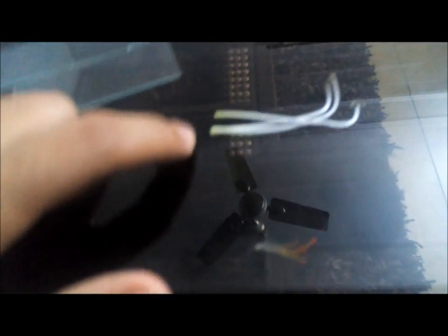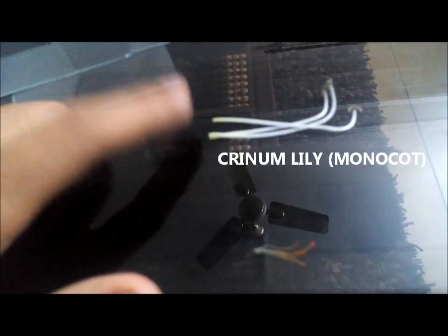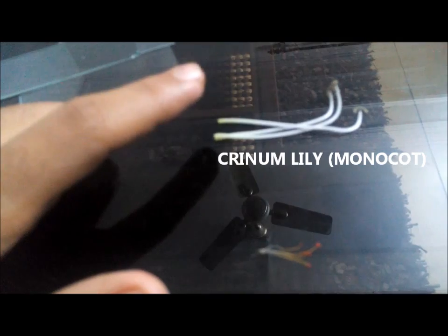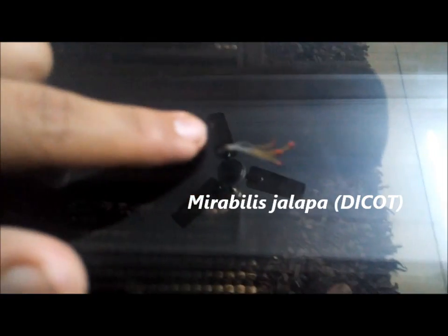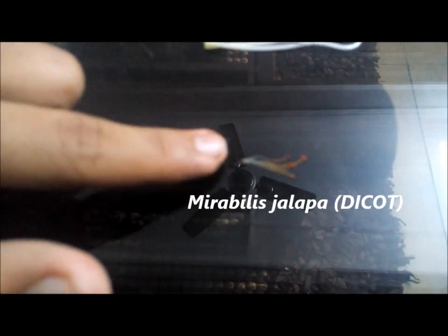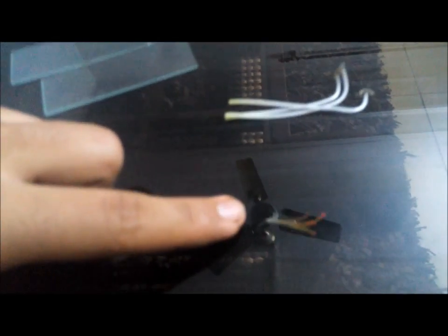This one is from a Lily, Crinum Lily and this one is from Mirabilis Jalapa. So this one is a monocot stamen and this one from a dicot flower.